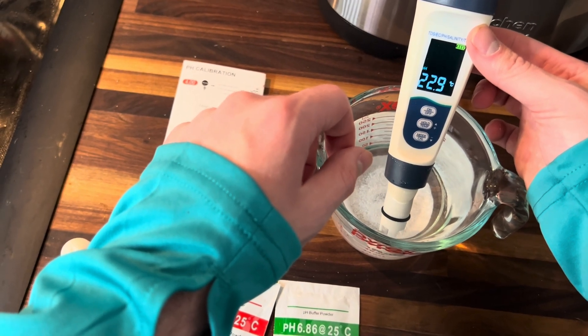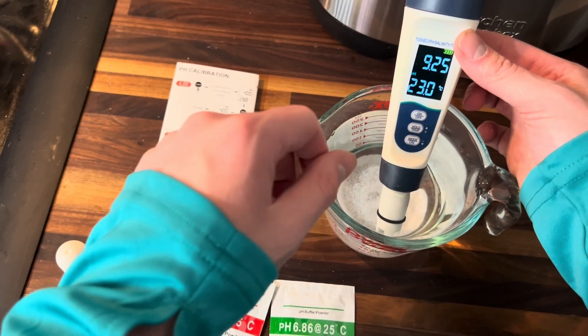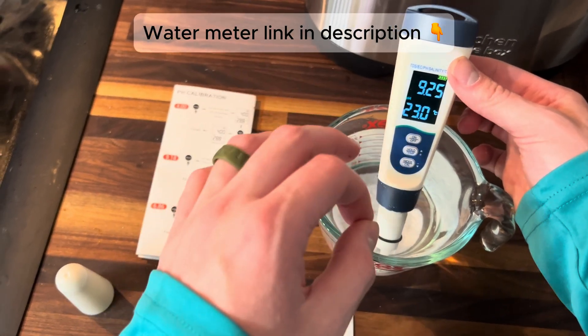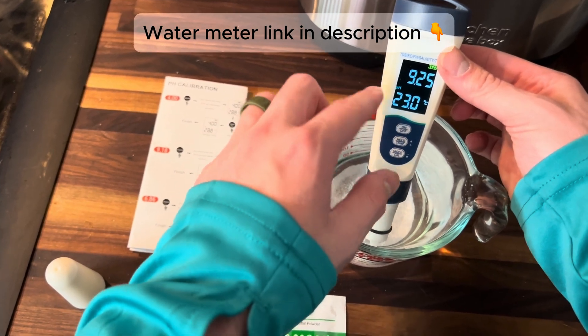When it's done flashing, you know that it's done calibrating. We're at 9.25, so there's a slight variance, but it's very, very close to 9.18. That means it has successfully calibrated.